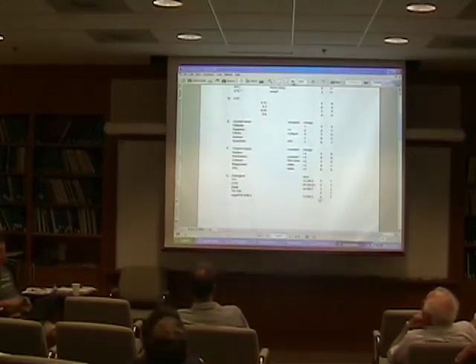Okay. I just wanted to make the point that not all of these anions are compatible with these cations in terms of solubility. For example, if you try and make magnesium citrate, not very soluble. So anything that's not soluble, I've noted here, and then when that comes up in the random number screen, just pick a different number.